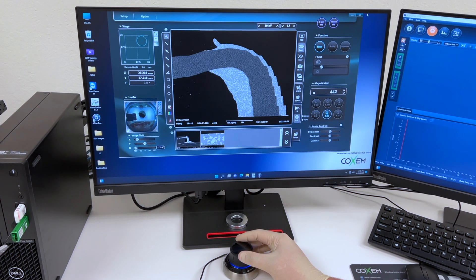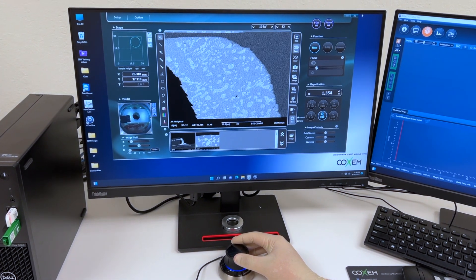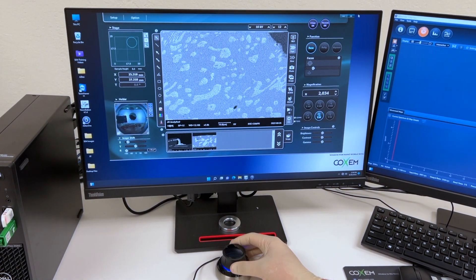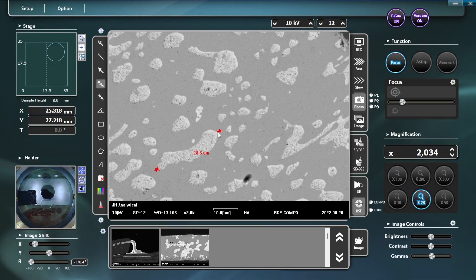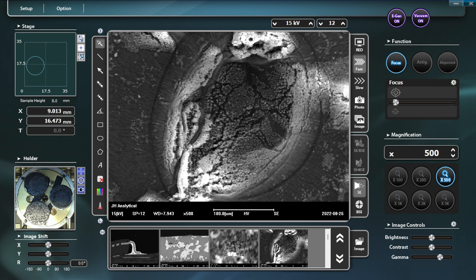Increasing magnification is easy and completely computer controlled. Once we get to the magnification we want, it's simple to measure with micron level accuracy. We have additional capability using the secondary image to create higher contrast and thus more detail.